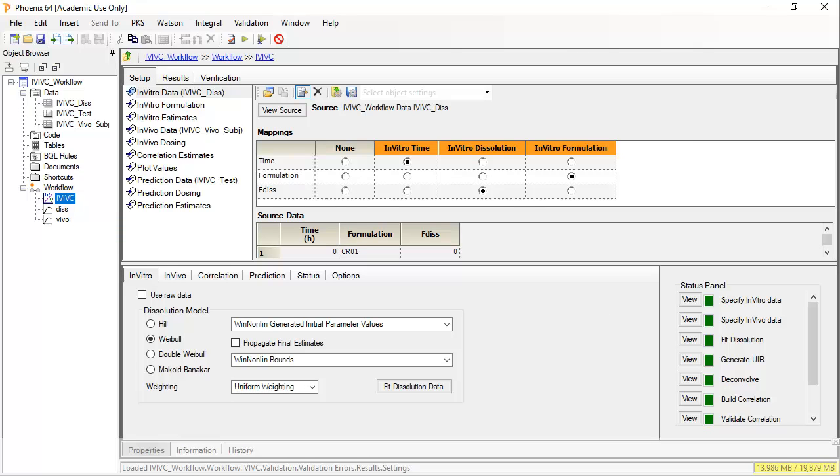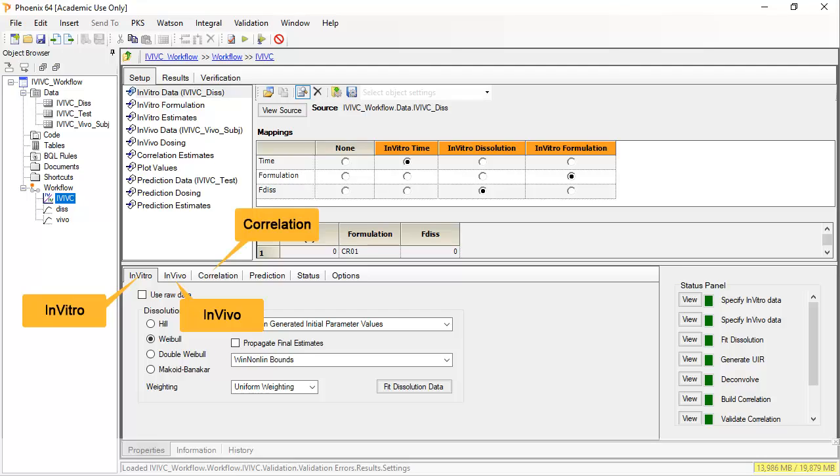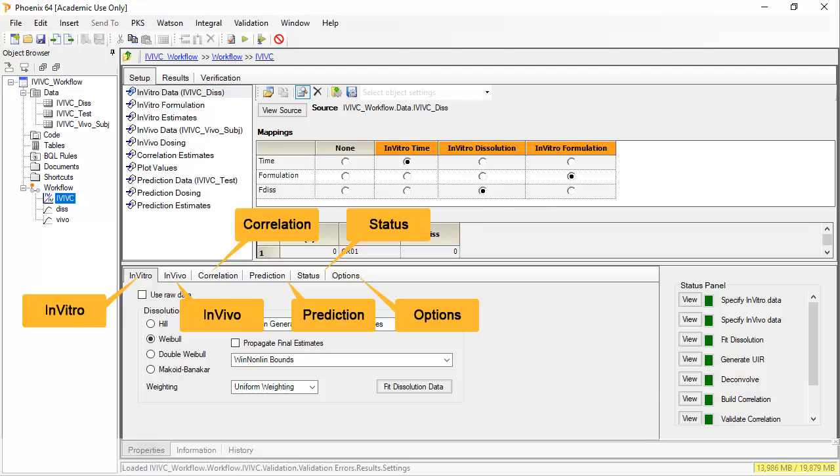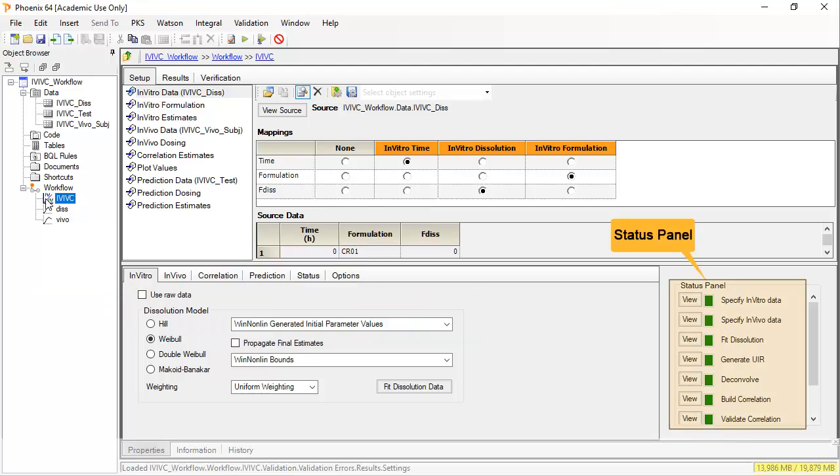It is quite a complicated object. There are four tabs: in vitro, in vivo, correlation and prediction, relating to building and predicting from an IVIVC model, as well as tabs displaying status and the general options. There is also the status panel which indicates which steps have been set up and executed.